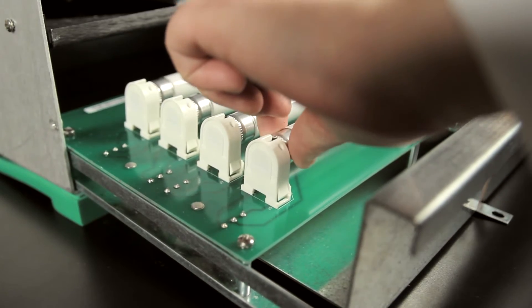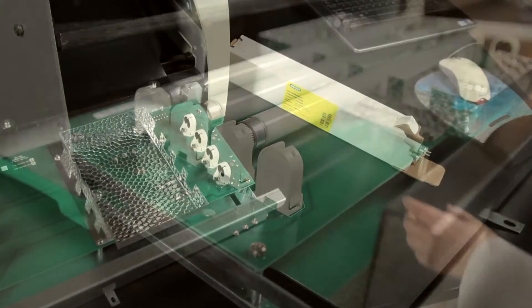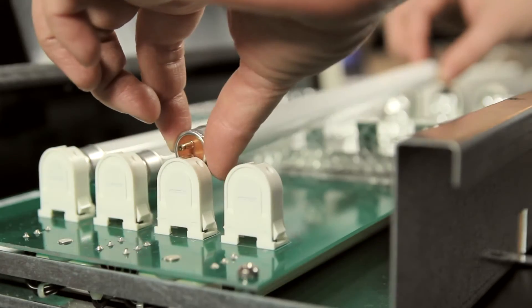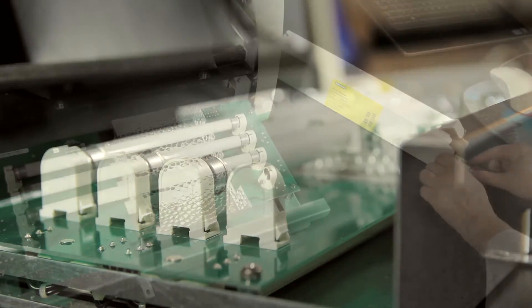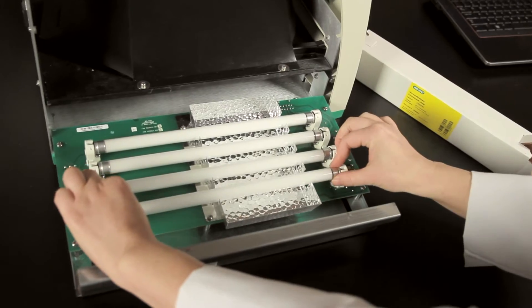Remove the lamps by twisting counterclockwise and slip them out of position. Replace each of the lamps and twist clockwise to lock them in place. And remember, even though only one lamp might have burned out, it's best to replace all the lamps at the same time to provide even illumination for gel images.